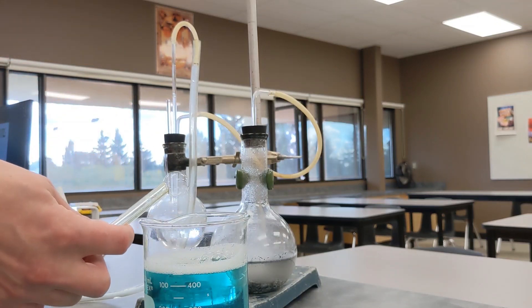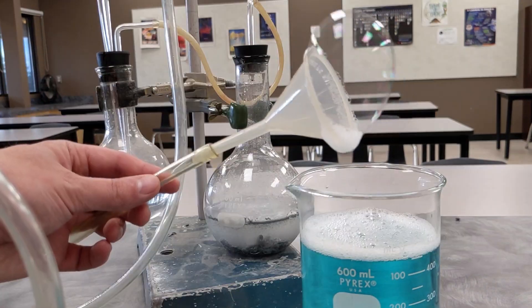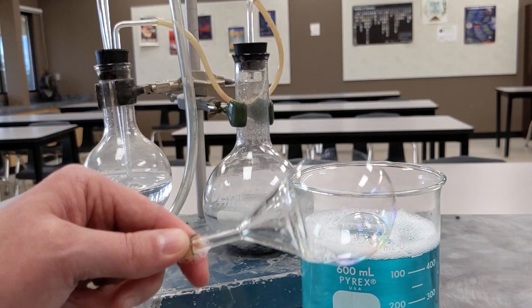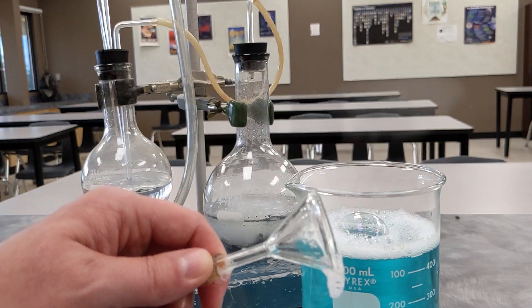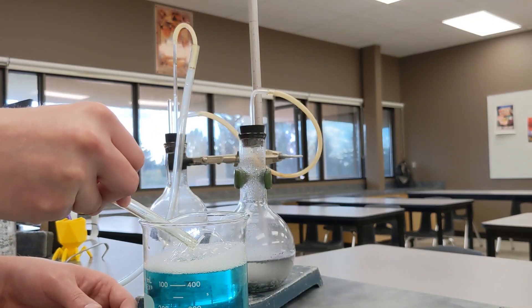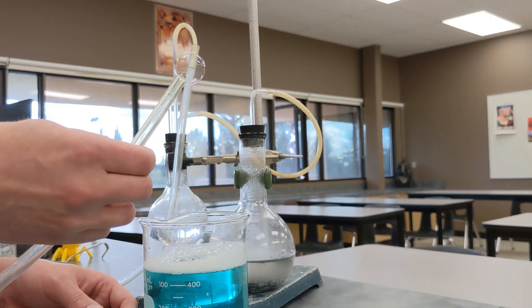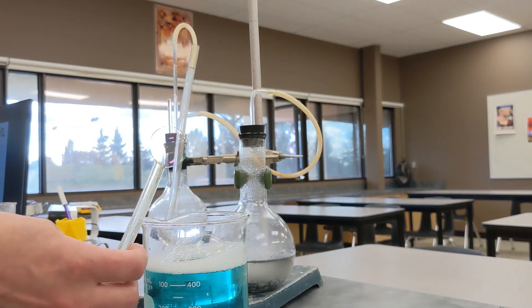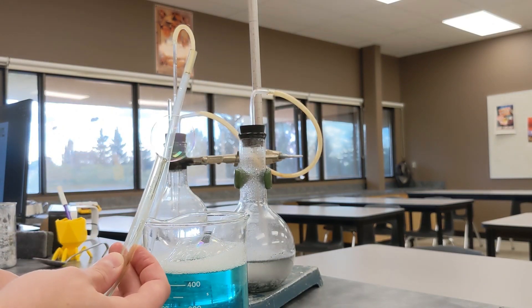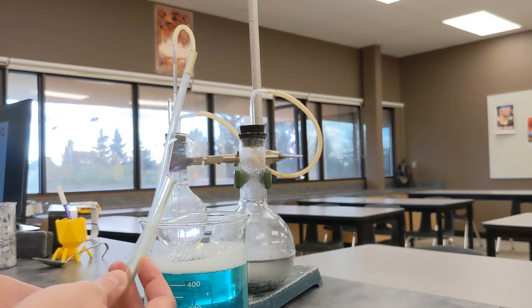You can also blow bubbles with the end of this tube, although getting them to release from the tube takes a little bit of practice. But once you get the hang of it, you can get the bubbles to release from the end of the wand. They're going to rise because they're lighter than air, the hydrogen being less dense than the nitrogen and oxygen that make up the atmosphere around us. If you let the bubble form slowly and then give it a gentle shake while holding it upwards, it will release and rise.